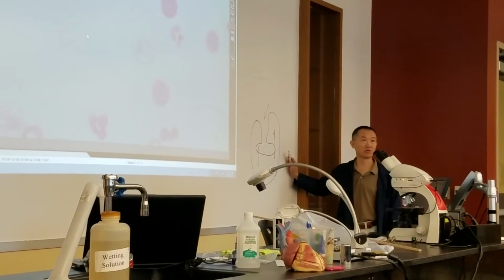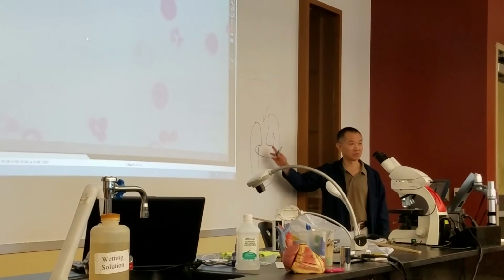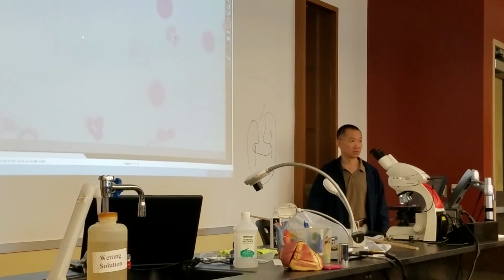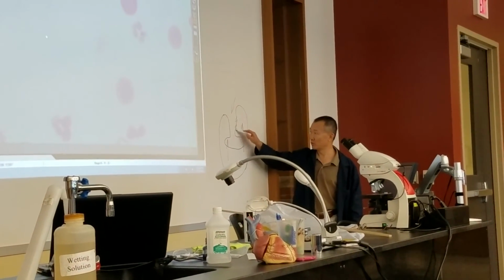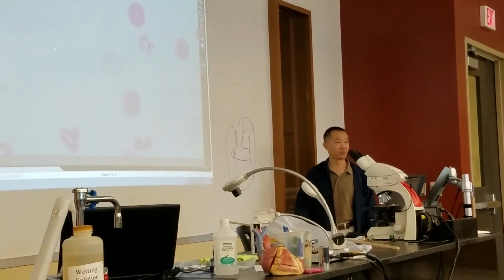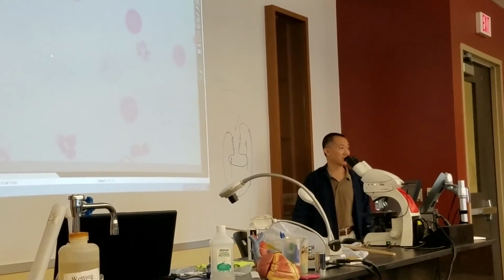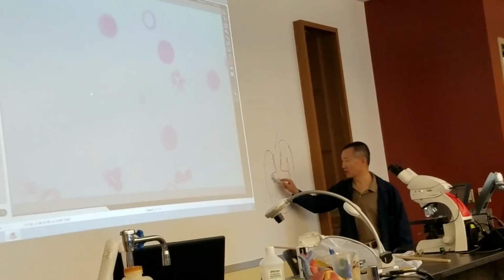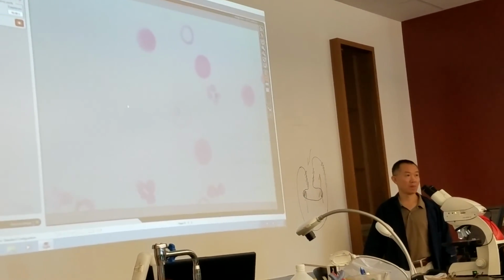So we already selected the slides that have an embryo like this, and those questions will be asked. The left is the endoderm, and this portion will form the future endoderm. This portion will form the future ectoderm. You got that? The mesoderm will be this part. Are you going to be testing us on that even if it wasn't on there?